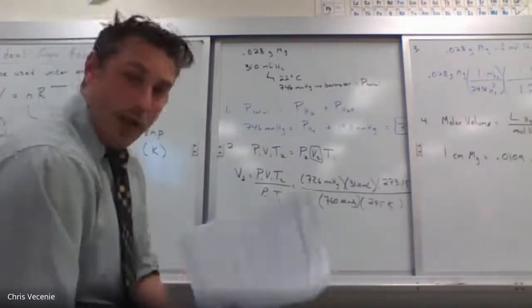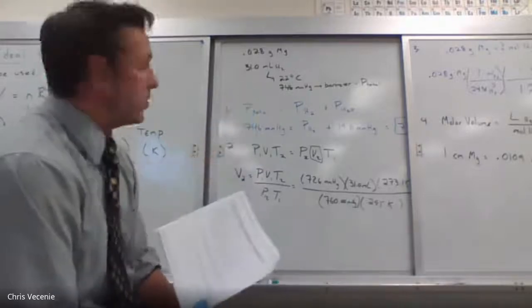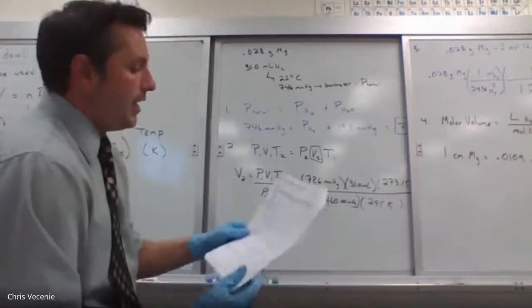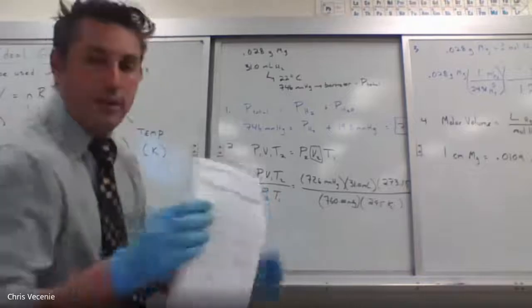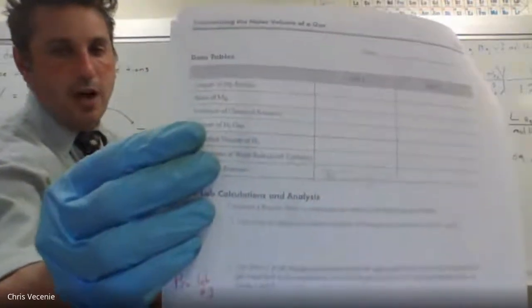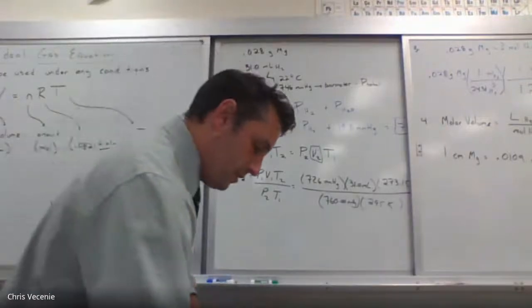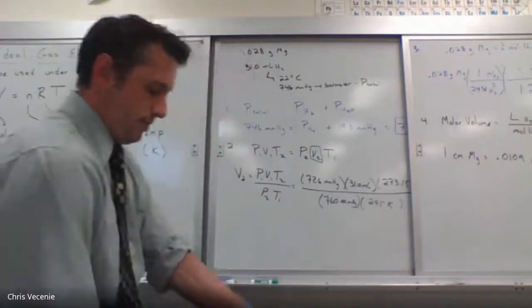All right, so all I have left to do, and I'm not going to have to post a separate video because I actually had time while the hydrogen was going to show you guys those calculations, is I want to talk about filling in our data table. You can already fill in the very top box, the length of the Mg ribbon. My Mg ribbon was 3.0 centimeters.